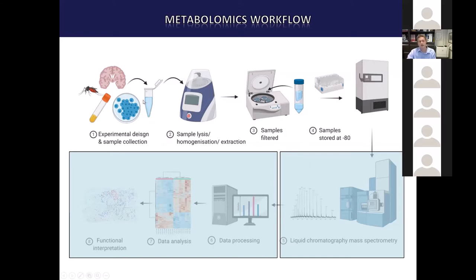We've done a lot of work, and people do a lot of work, to make sure that in that process, and we keep it as simple as possible, we're not disturbing that profile. There's lots of things that could, a filter, for example, might hang on to lipids more than it does to hydrophilic molecules, or vice versa. So you need to test all of those things. But there are protocols that we use that are fairly robust. This is part of lysing and then filtering.